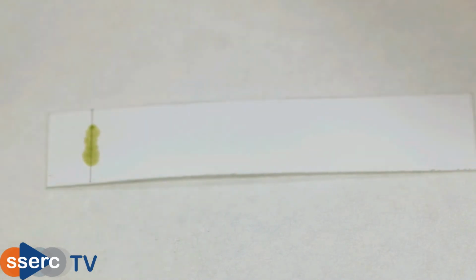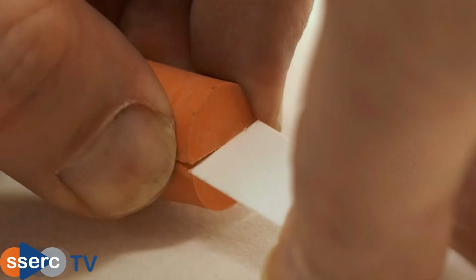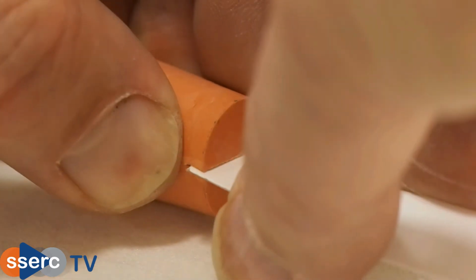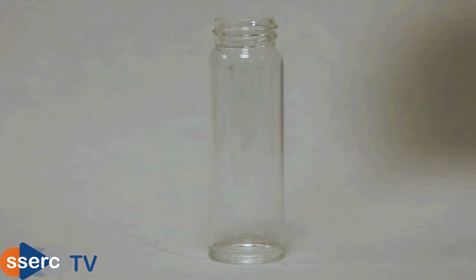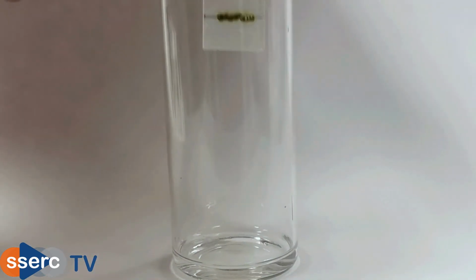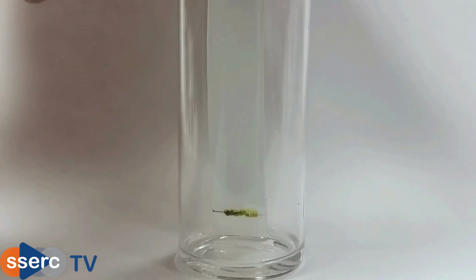Now we need to make sure that the TLC plate is secured in place in its jar. We're using a rubber bung that has had a slit cut into the bottom. We squeeze the bung and slip the top of the plate into it. Next, we add a small amount of solvent into the bottom of the container, a milliliter or two should be plenty, and lower the TLC plate so that the bottom is just dipping into it.